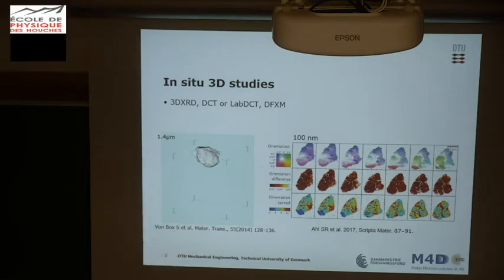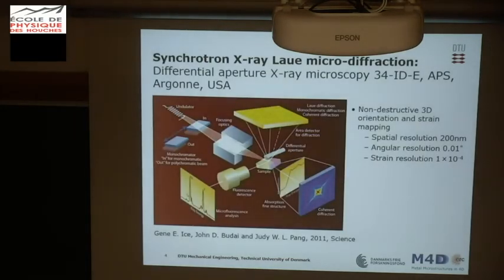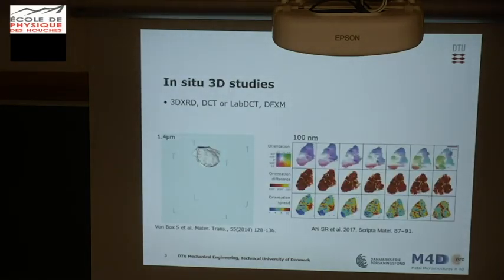Here are the growing grains, and you can see that the grains are not spherical. There are a lot of protrusions and retrusions locally, and during its growth, it just continues this way. With this technique, we can also map that the recrystallized grain itself is not perfect.